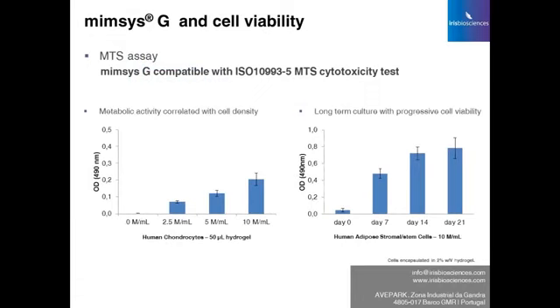And also to check cell viability, we commonly perform MTS assay. So MTS is a cytotoxicity test used in the ISO guideline 10993. So we use this to check cell metabolic activity within the hydrogel.